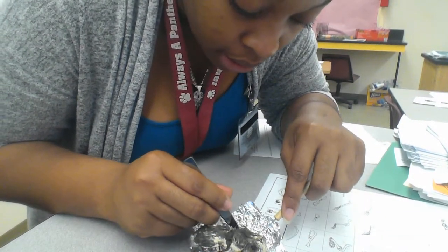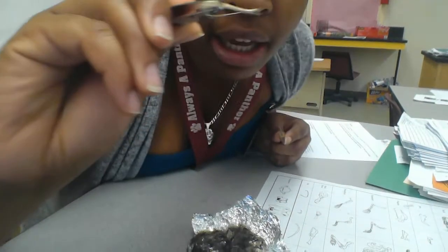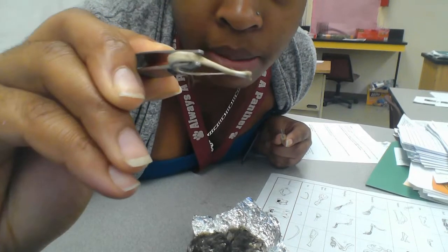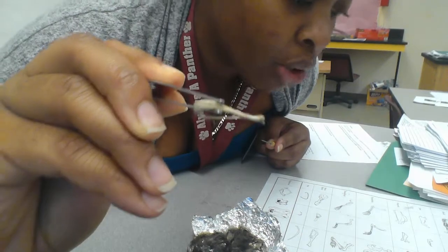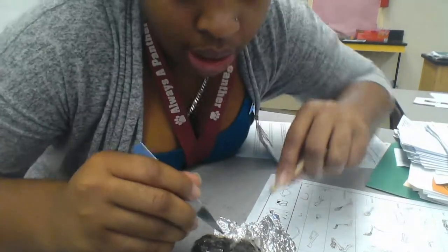Oh, we got a couple of scapulas. See, this is what it looked like before I took that other bone off. See that thin bone? Yeah, that was a part of it. But I don't see anything that looks exactly like this on the paper, so that's why I said it was the scapula. And we're gonna find another one of those, so we're gonna put that there too. So we found another scapula of a mole.